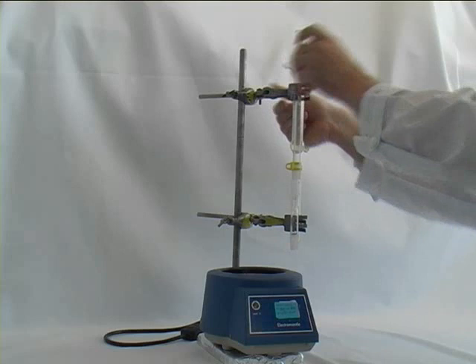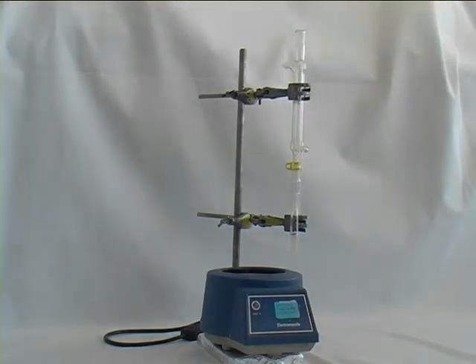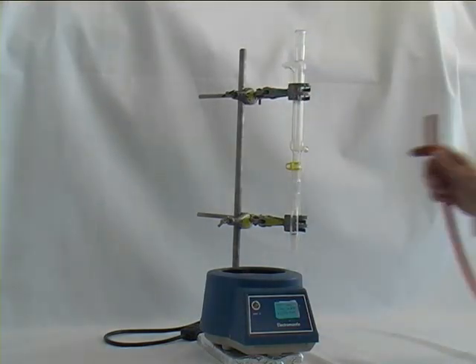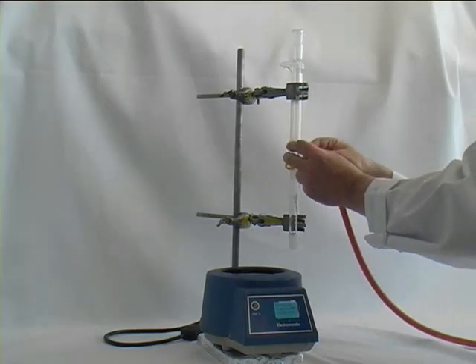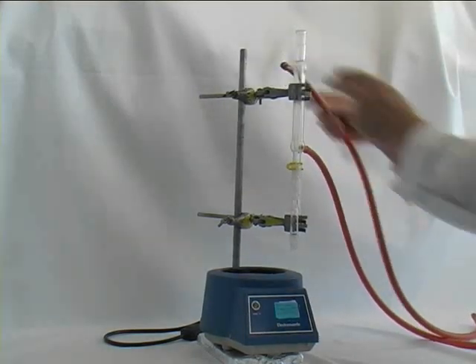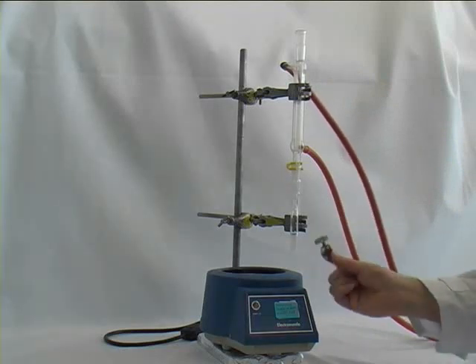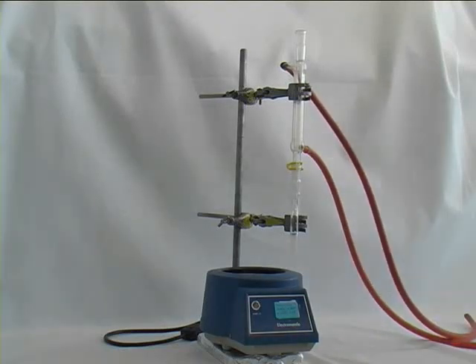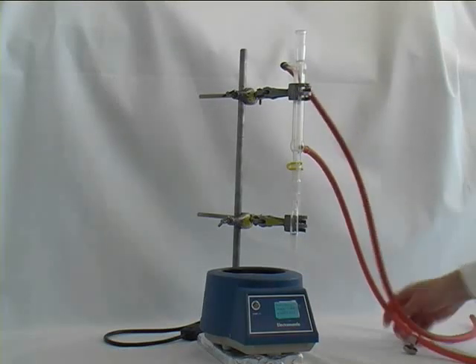Before we set up the rest of the apparatus, we turn the apparatus a little bit out of the way, and we add the tubing to the condenser. Please make sure that you secure the tubing to the condenser using jubilee clips.